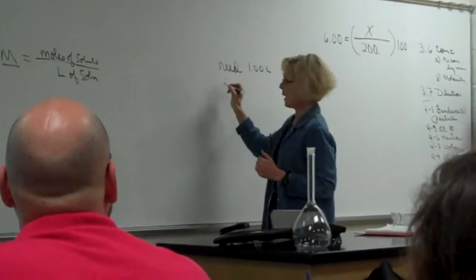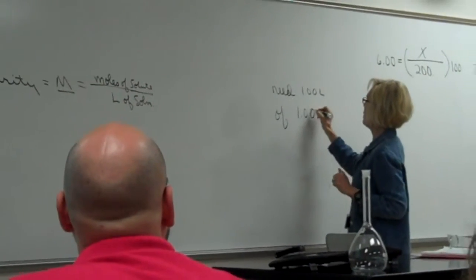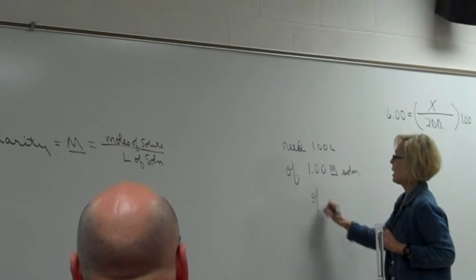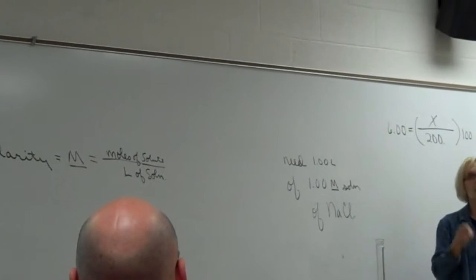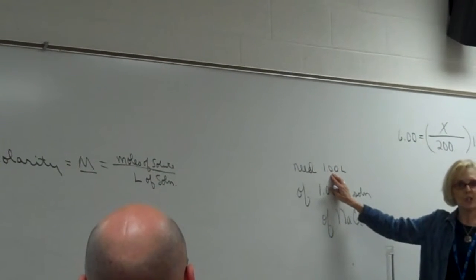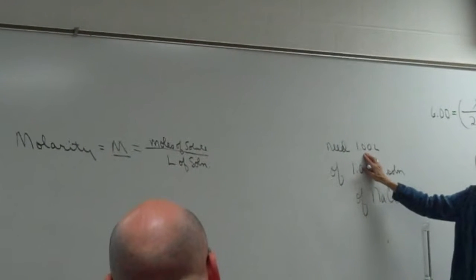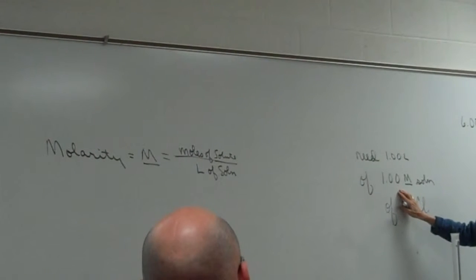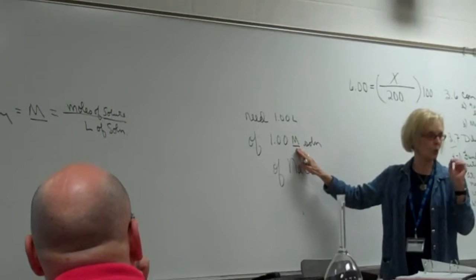1 liter, and I'm going to make the math incredibly easy. I need 1 liter of a 1.00 molar solution of sodium chloride. Okay, now, why in a real lab do you work like this? Because I have 30 students, I reasoned through to have enough solution for all 30 students, or 15 pairs of you, it's going to take about a liter. So let's go make a liter of it. And for the experiment we're going to do, it should be 1.00 molar.